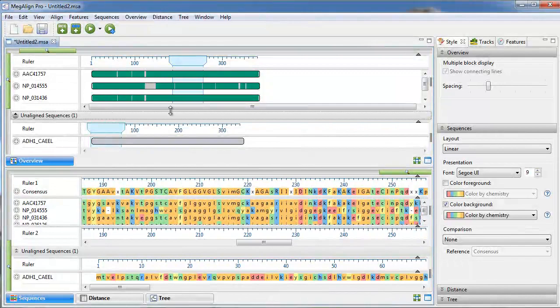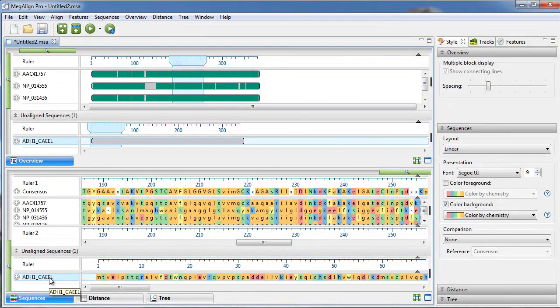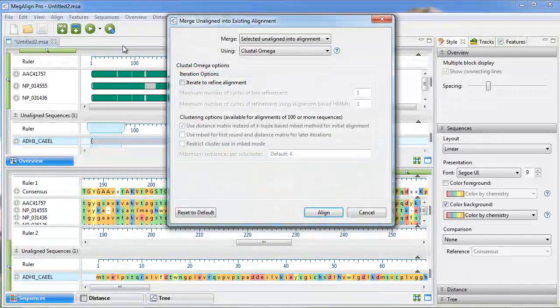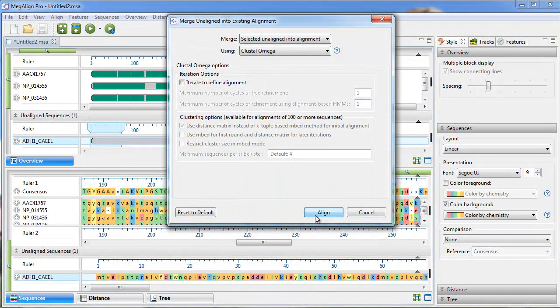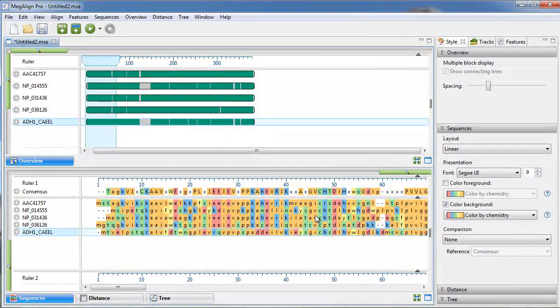You also have the ability to align additional sequences to an existing alignment, as well as merge two existing alignments together.